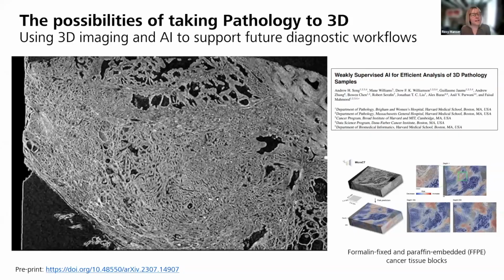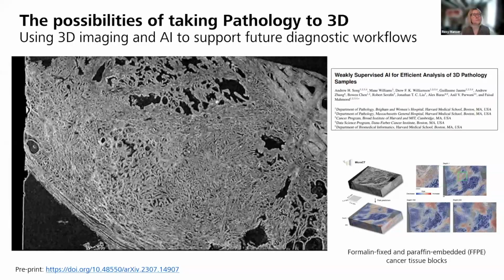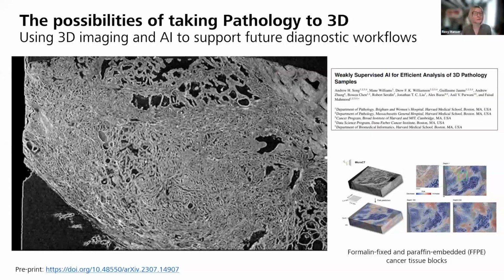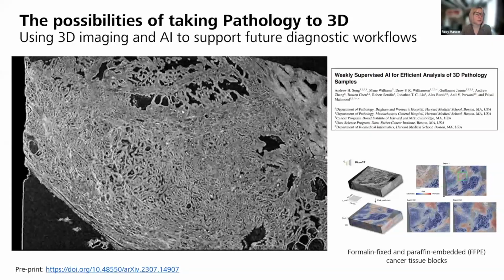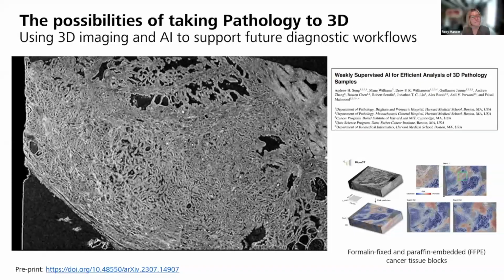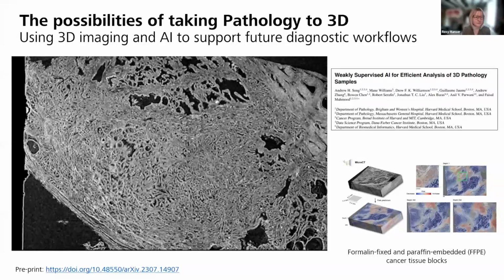And then in the world of diagnostics, this is a really lovely preprint paper that came out last year, comparing how different patient situations can impact the tissue. So this is a cancerous group and a non-cancerous group of human tissue biopsies that they've compared here. And the goal is to come up with predictive methods for diagnostics using AI. And the X-ray technology in this case was used. These are paraffin-embedded, unstained specimens, which have been imaged, around 80 of them in total, to be able to generate that deep learning matrix.